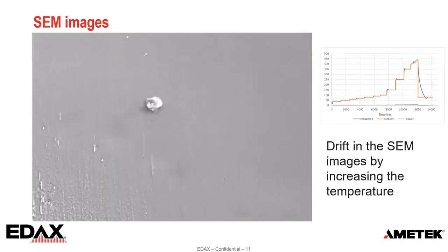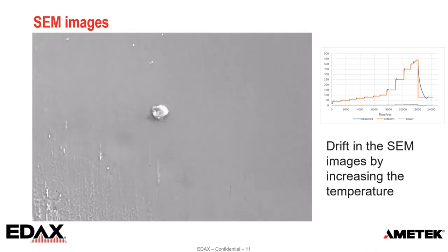So you can see a drift in the image, and this drift is related to the temperature, meaning by increasing the temperature, we obtain a shift in the image.